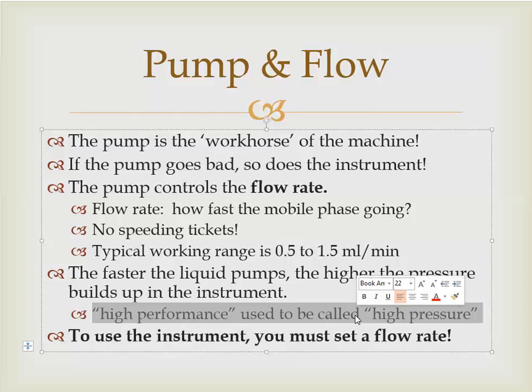1.5 is typically the highest value that we see. 0.5 is typically the lowest value that we see. That's what we call the working range most of the time with whatever experiment that I'm doing. Higher than 1.5 and lower than 0.5, you maybe could see some of that out there, but it's not used that often because we do see problems with the separation and as far as my components are eluting from each other.